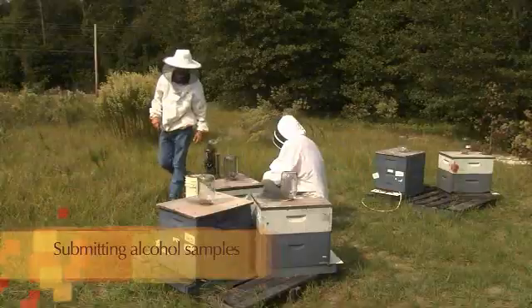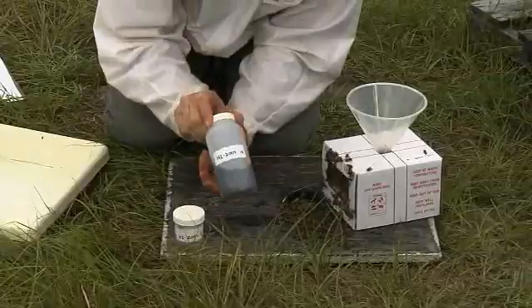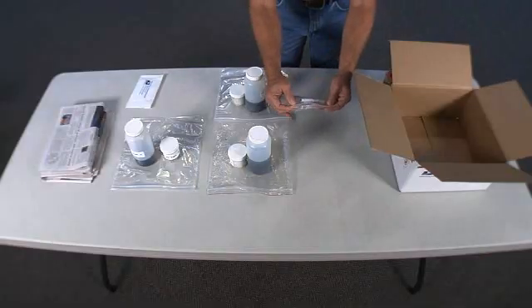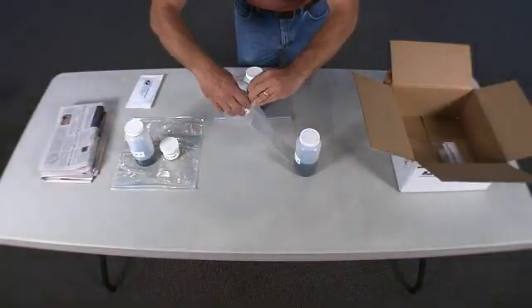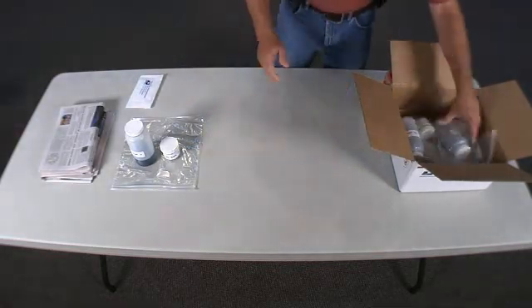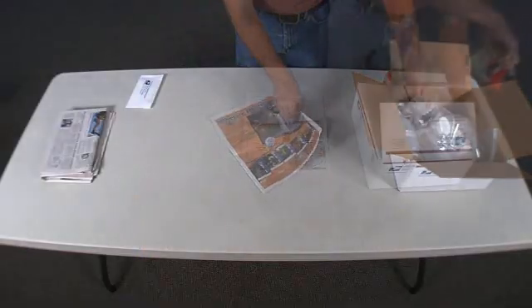The last step in this process is submitting the alcohol samples. When you have completed sampling all your assigned apiaries, you can send the alcohol samples and data sheets in the provided mailing box. If possible, photocopy your data sheets so that you have a copy for your records. Place all data sheets in a Ziploc bag and place these into the large flat rate shipping box. Double-check that all the lids of the bottles are secure and place these in Ziploc bags, then place the bottles into the flat rate shipping box.